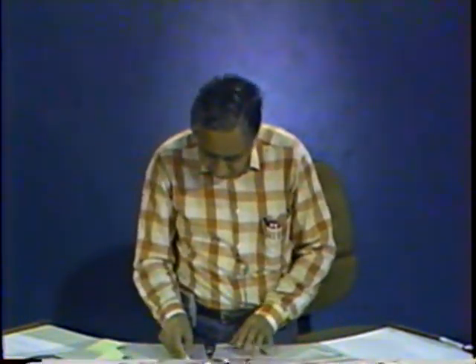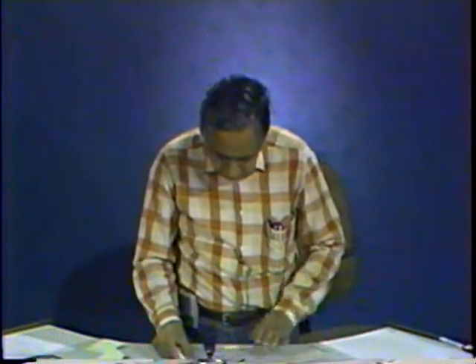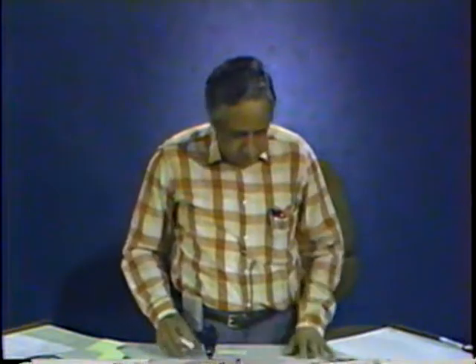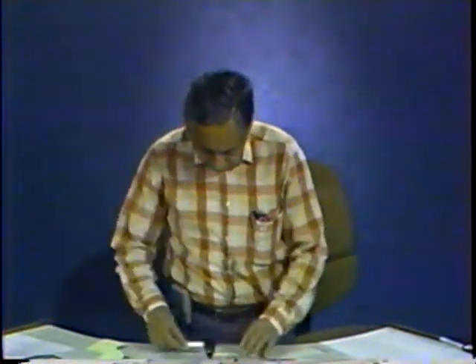Oh, a minor correction: the earlier page numbers were wrong. It was page number 7, 8. And we already used COSY in lecture 4 in application. And I'll just go through the application to the relay COSY in this now, another 5 minutes. Although we don't have 5 minutes, I'll go through this because this then illustrates what's going on.